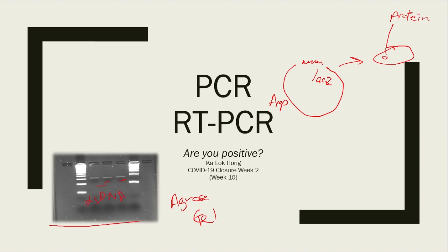And in fact, this little gel image is from my lab, a student produced that, and the idea, if you imagine this gel in association with the plasmid, is that when you have a plasmid with the gene being inserted into the plasmid, you can do PCR to verify this segment being present. If yes, there will be a band. If you have a construct without the gene, a straight line, then no construct, then there will be no band appearing in this agarose gel.